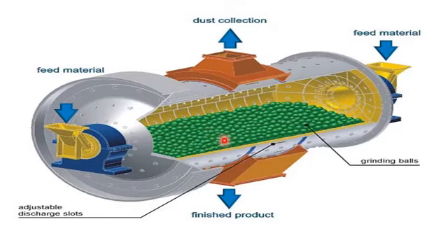Okay, and also please note that this crushing or conversion of the bulk material through ball milling takes a lot of time. Usually the process may continue up to 24 hours. So in simple words, ball milling is a time consuming method. You can prepare a nanoparticle over a longer period of time.